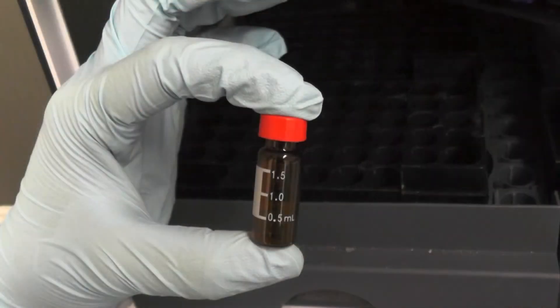Note that the maximum capacity of HPLC vials is 2 ml. Therefore, it is best to add the volume between 0.5 and 1.5 ml to ensure efficient sampling.